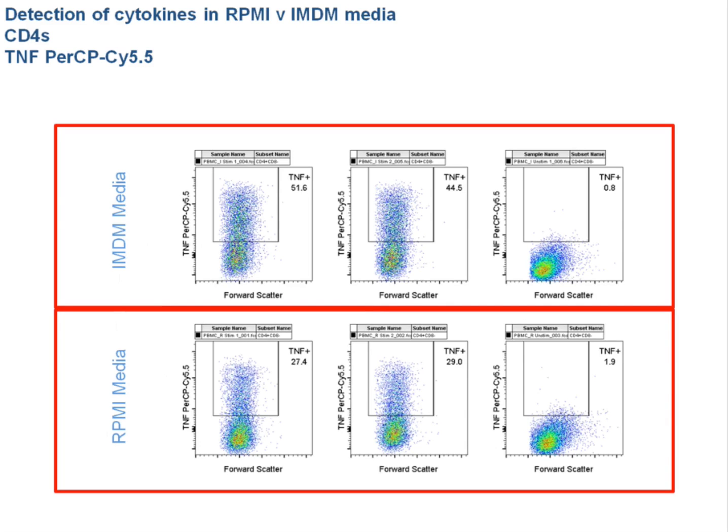You will see increased death in intracellular cytokine staining. Even, again, once they're fixed and permeabilized, they're all dead. But certainly once you activate them and you block them, you will see increased death compared to regular surface staining. So if possible, you can up the amount of cells to start with, but it sounds like that's not a possibility. You may want to minimize perhaps the controls, or minimize the number of samples, so you limit the samples, and then you have more cells per sample.